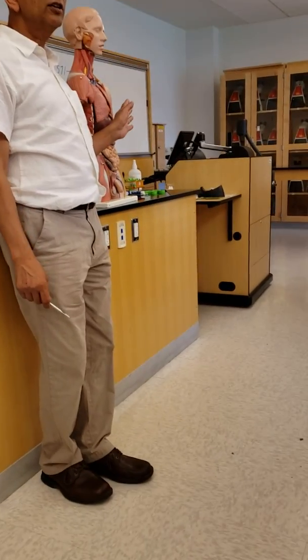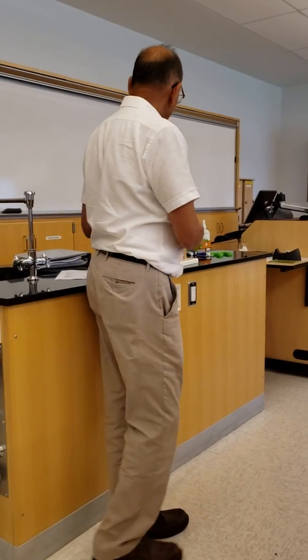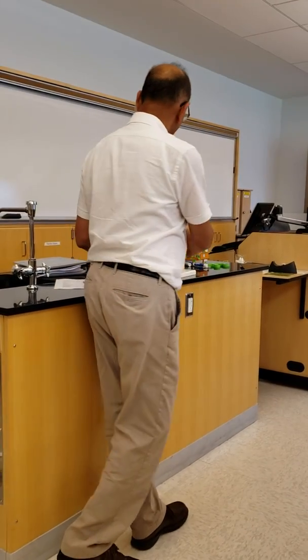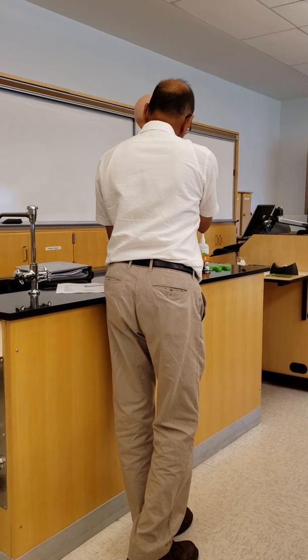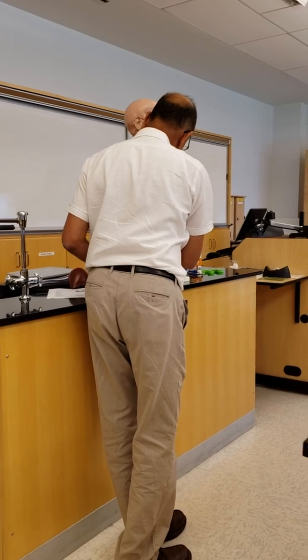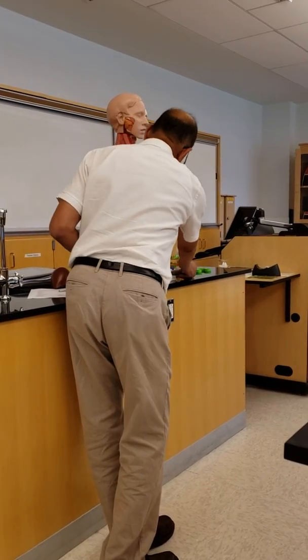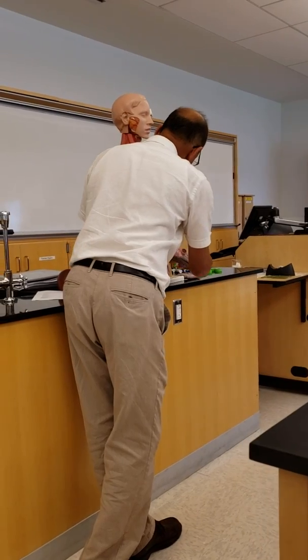Behind the peritoneal cavity, and there's so much back that to see the kidneys, you pretty much have to remove all these other organs, all of them. So you remove, for example, this liver here, abdominal cavity. You remove the stomach, and you remove the large intestine and small intestine here. You just remove this large intestine piece here and pancreas.